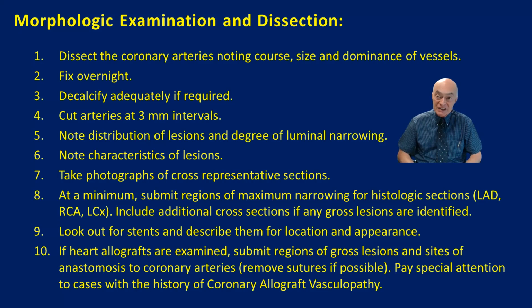So look for stents as well, in case that, before you start cutting, you want to be able to see if there is some kind of a metallic mesh inside these arteries, and describe the location, how many there are, and their appearance.